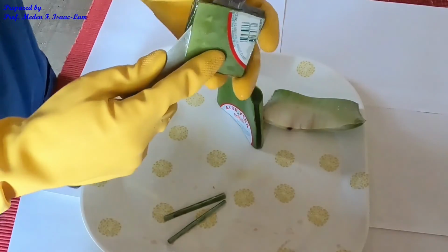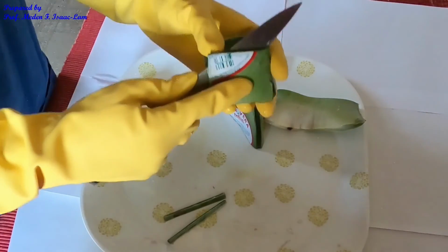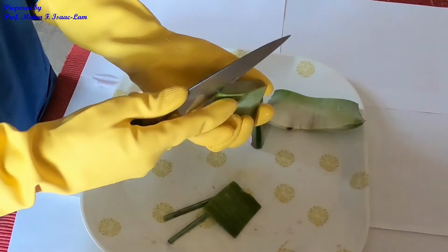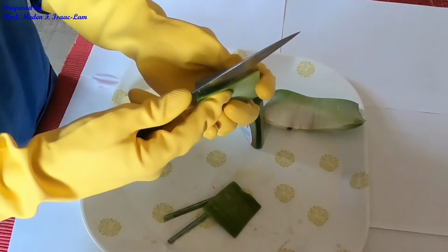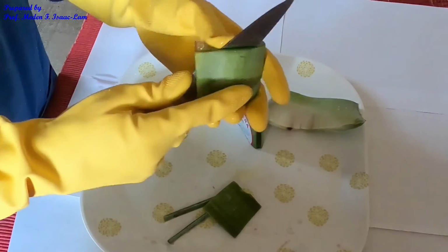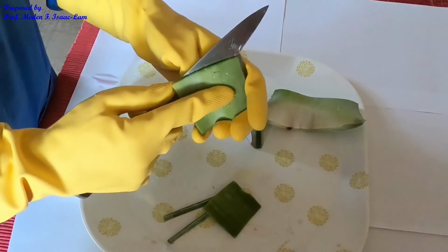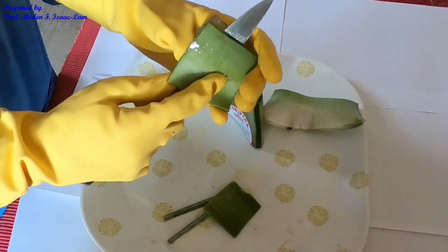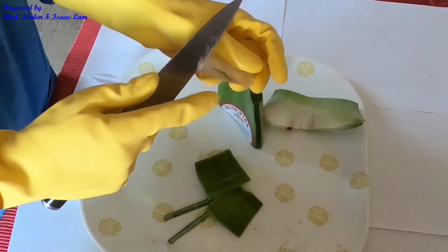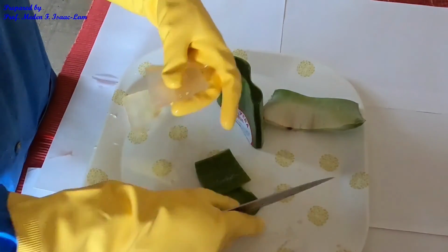So you can take out that layer, and again on the other side, take it out, and it's very easy to remove. It's soft, but this green stuff is hard. So I got the gel.